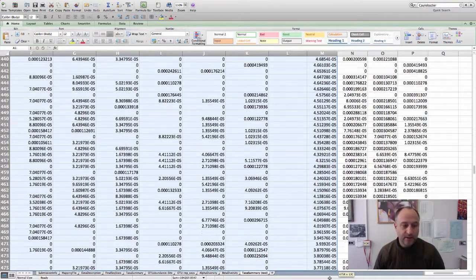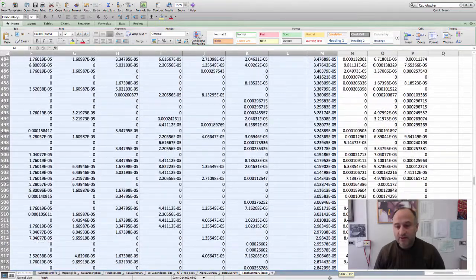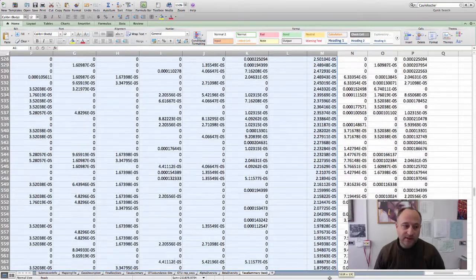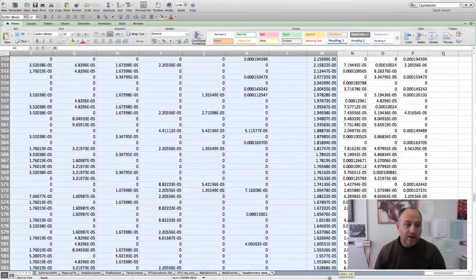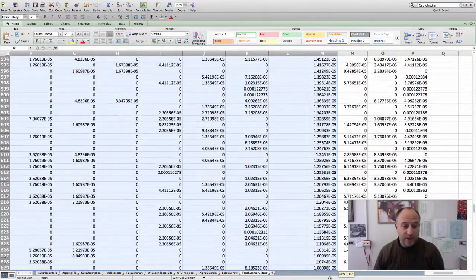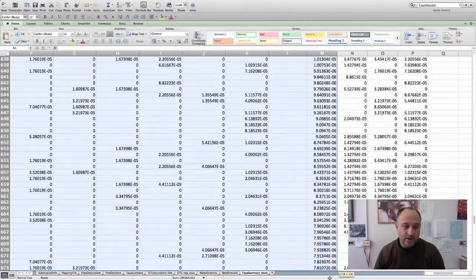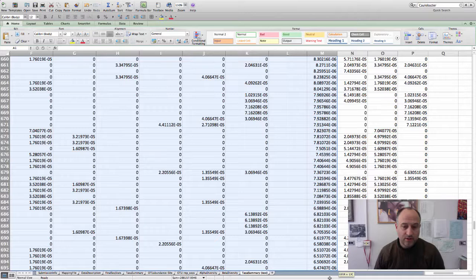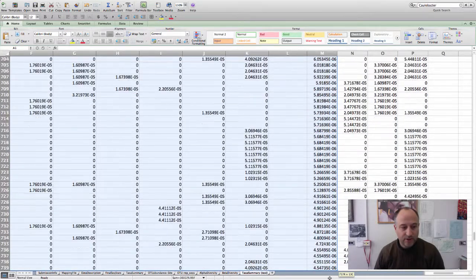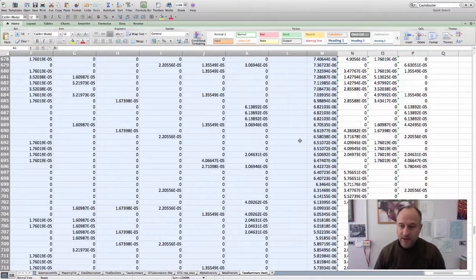And again, you can see if you're on the left that we're scrolling down, we're to 500 now, so we'll be to 800 soon. But again, one of the reasons we want to trim down the data is because it's kind of a pain to have to deal with all 800 entries if we're not necessarily concerned about, at least initially not concerned about those that are represented at very low levels. Okay, so we're getting close to the 823. So we have all the data that we're interested in selected.